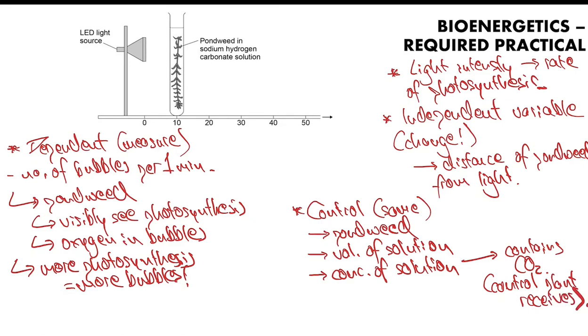And then obviously the other main control variable is the amount of time that you measure it for. So say it's about a minute.